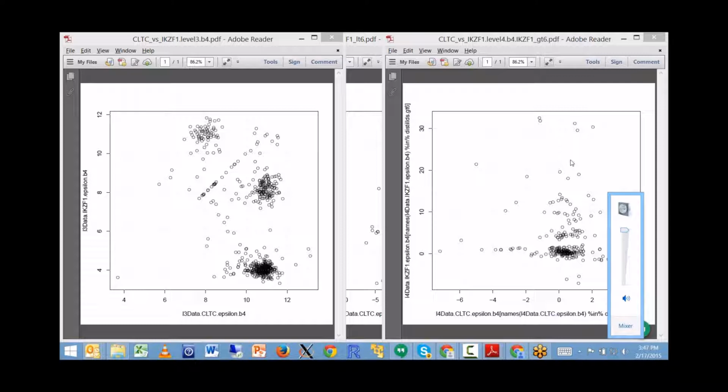In the same way that there is significant interest in this L1000 data. And maybe some of these other data sets will also offer opportunities to benchmark L1000 against these other data types.